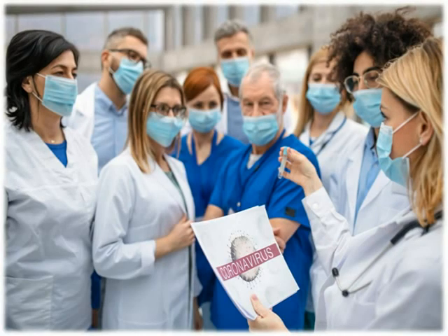If airborne hazards are present, or likely to be present based on the hazard assessment, the employer or infection control practitioner will select appropriate and properly fitted respirators that will protect workers from the airborne hazards. This includes specific training on the infectious disease and which respirator will be used to protect the healthcare worker. This guidance is provided by the State Health Department and the Centers for Disease Control to the employer. Recommendations are provided about respirator use and other precautions to protect the healthcare worker.